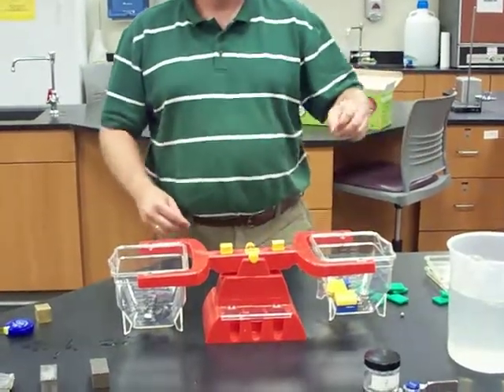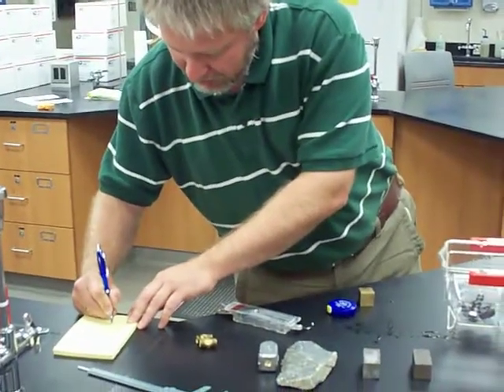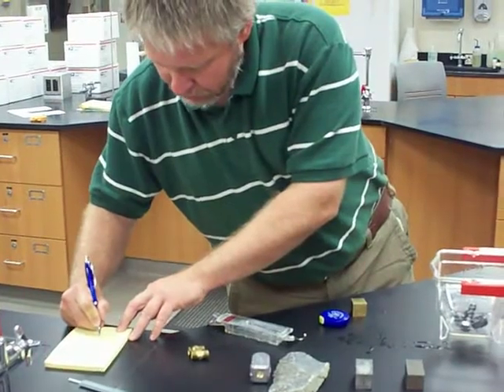That looks pretty good, right? Okay, so 173 is the mass for these steel screws.